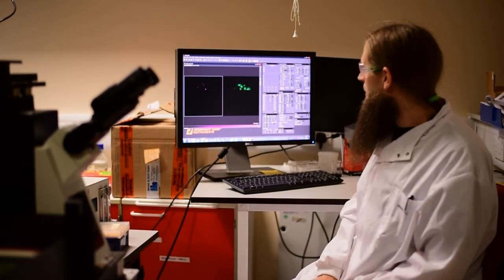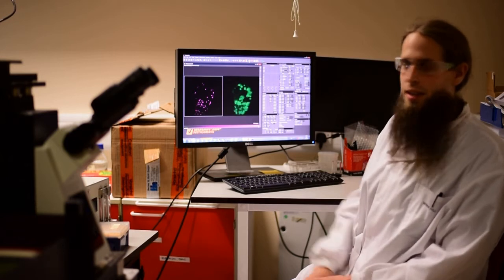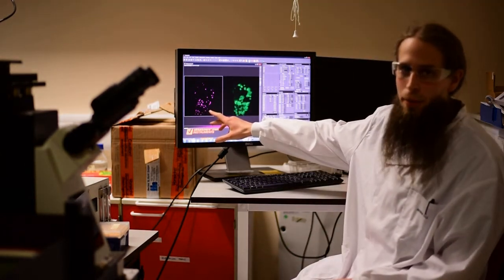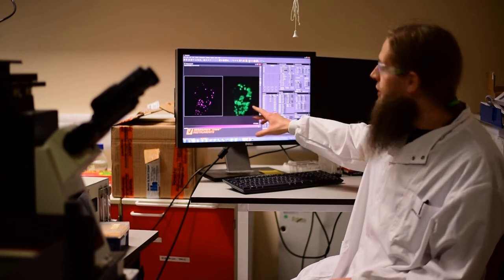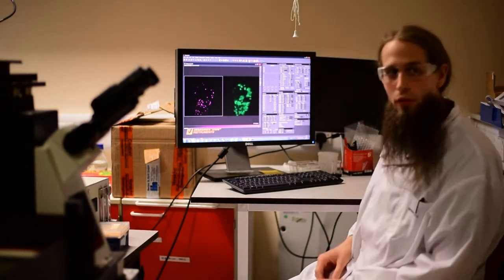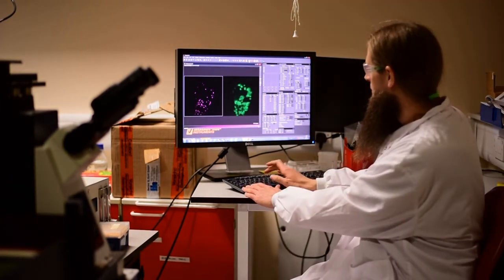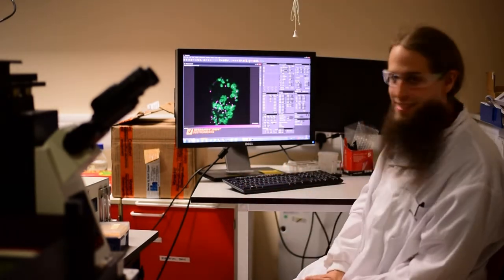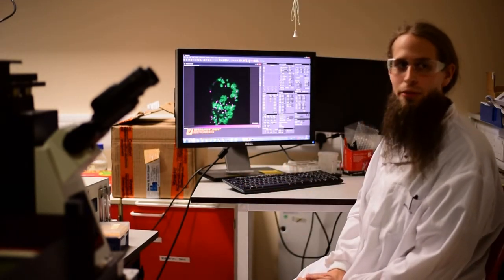So I turn on the microscope and we can see that we get signals from one protein labeled in purple and one protein labeled in green. And if I now overlay the signals, we can see that these two proteins do not colocalize. Wow, that's really cool.